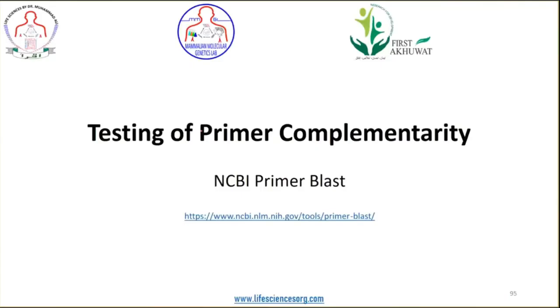Next, we are moving to the testing of primers. Primer testing is very important. Even if we download the primer sequence from some of the papers, we must test these primers, whether they are good or not.